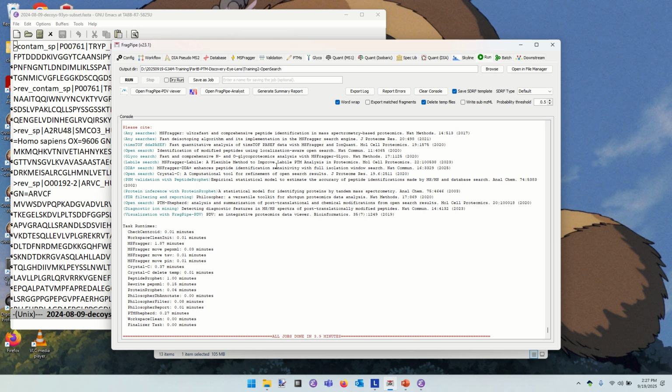Yes, I have a question about how we solve this. If you say this mass shift can be explained in multiple ways, how do we know which one is which? That's great. The rule I most typically use for this, how do you choose among different hypotheses that could all explain a mass shift? My answer is the boring one is correct.